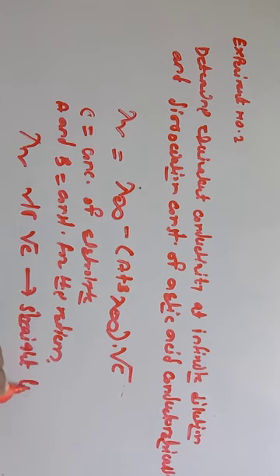The equivalent conductivity at zero concentration, or at infinite dilution, can be obtained by extrapolating the graph to zero concentration.